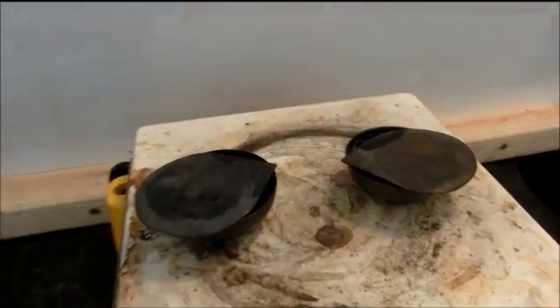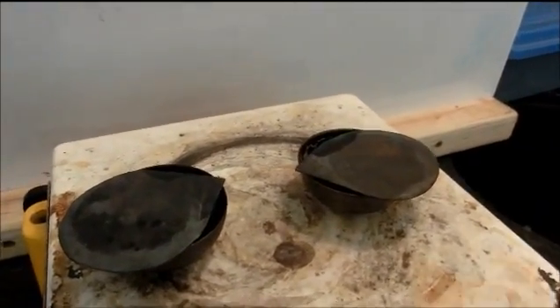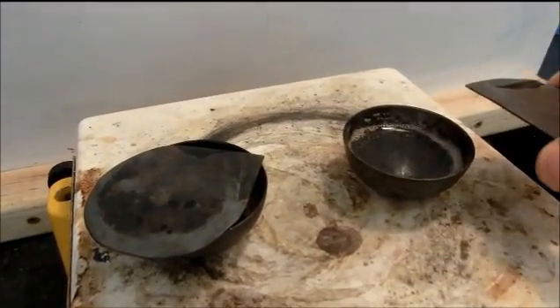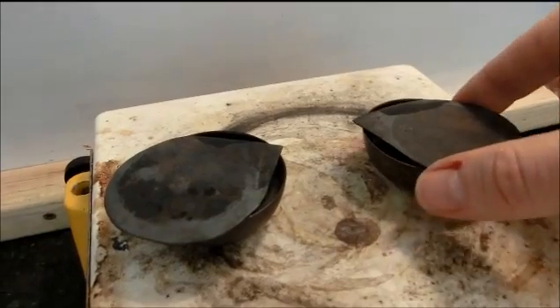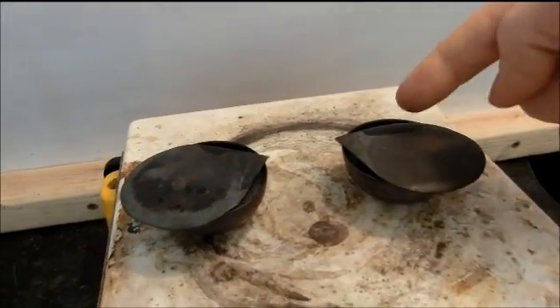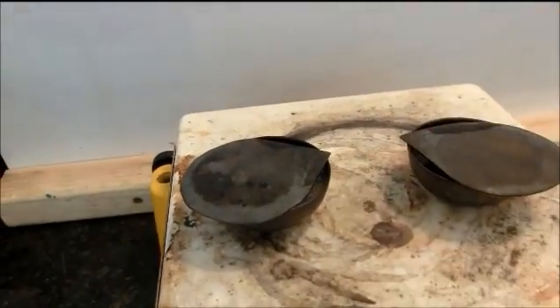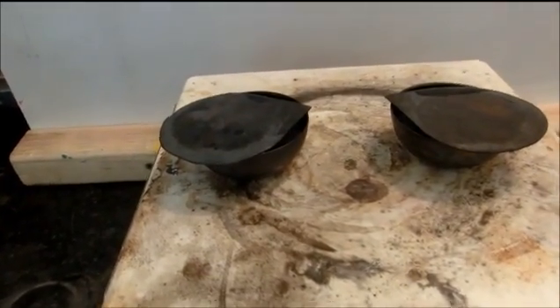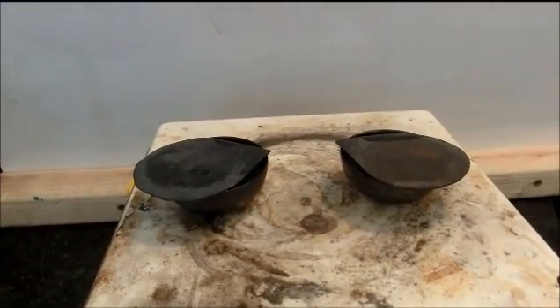After a few minutes, you will notice that it is now starting to bubble on the inside portion. It is boiling, and I don't want it to overflow, but I still want the vapor to release so those sections are open. I am just going to wait a few more minutes to get that completely dry.